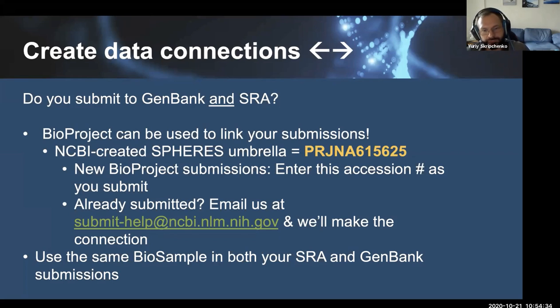This way, all of the bio projects submitted under SPHERES would be grouped together, making it that much easier to retrieve the entire data set if somebody wanted to process things in bulk. So make sure to use the same bioprojects and biosamples in both your SRA and GenBank submissions to make it easier for us to interconnect the data sets on our back ends.